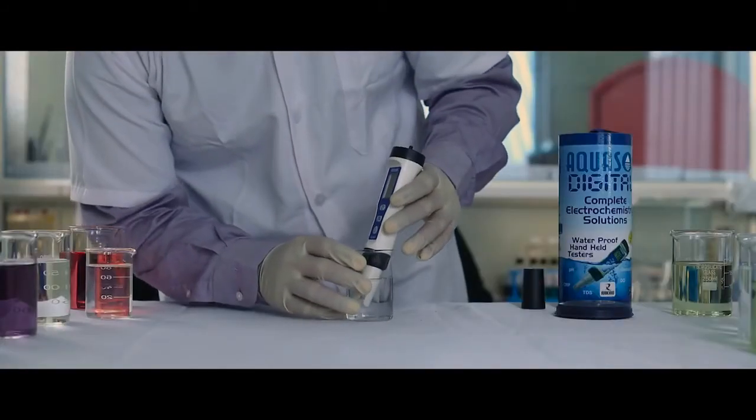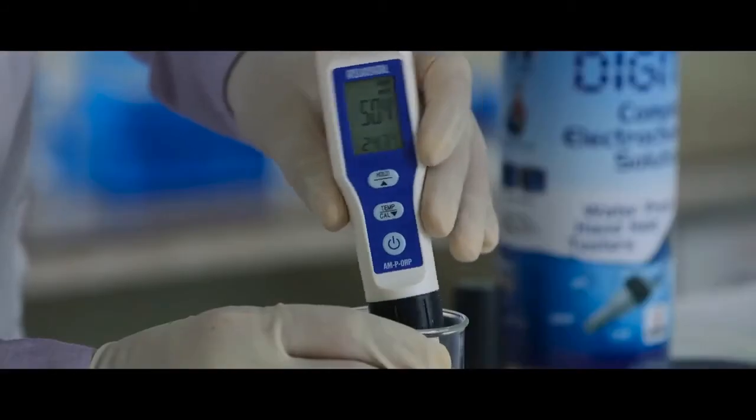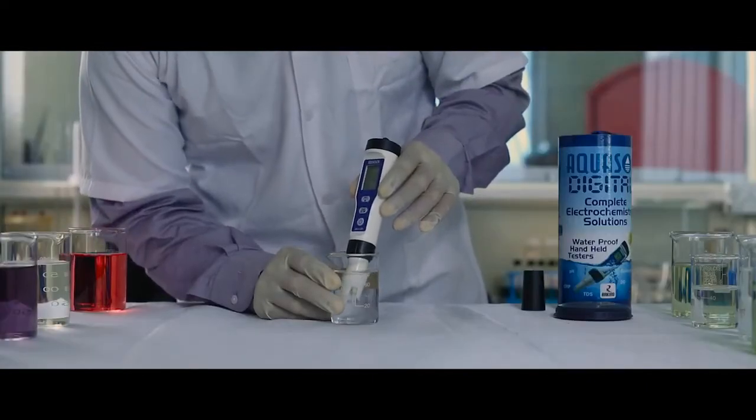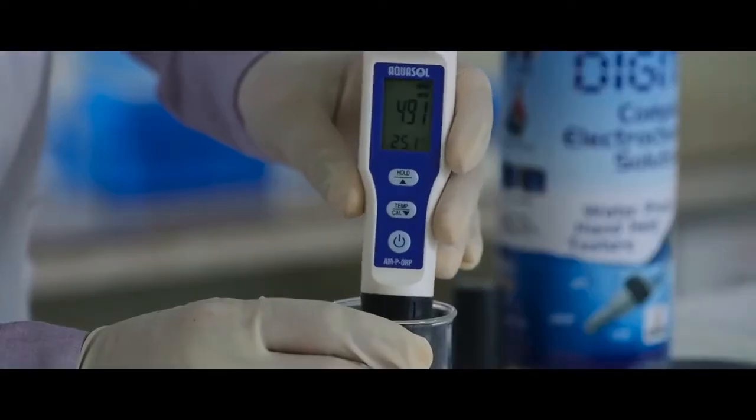Dip the electrode in the sample solution. Stir gently for a stable reading. Note down the ORP of the sample.